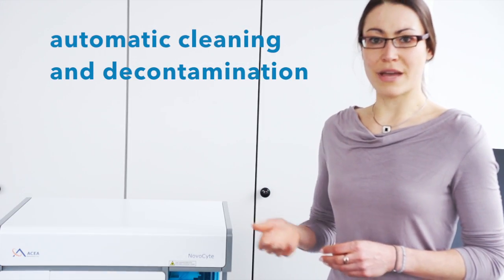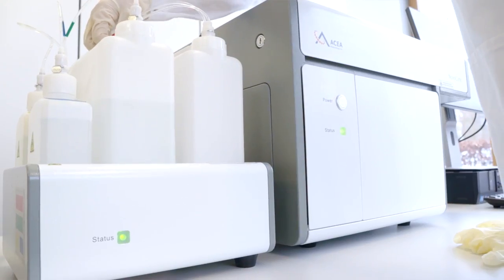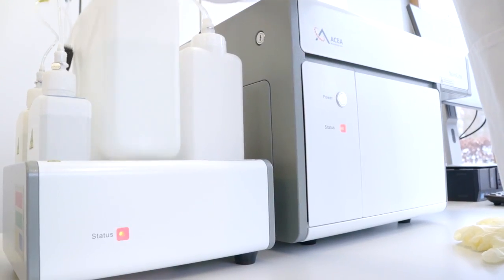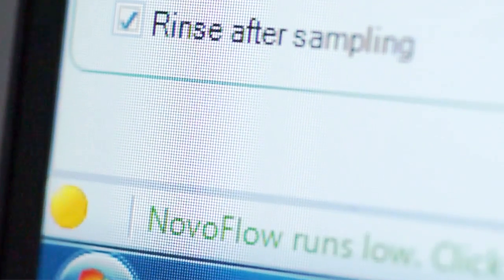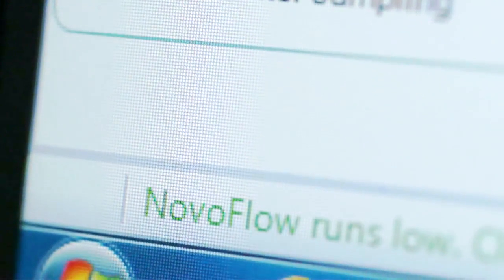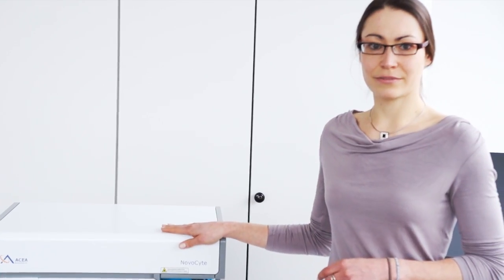You will even be automatically warned when system fluids reach critical levels. The first flow cytometer to take care of itself, allowing you to concentrate on your experiment.